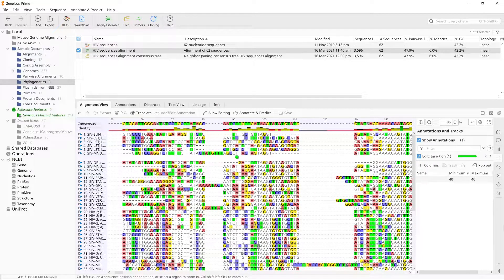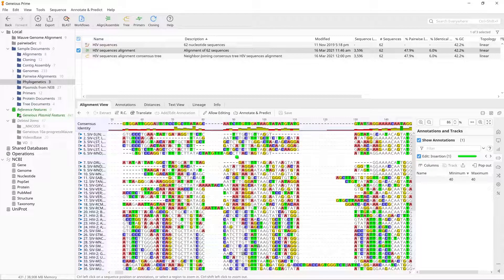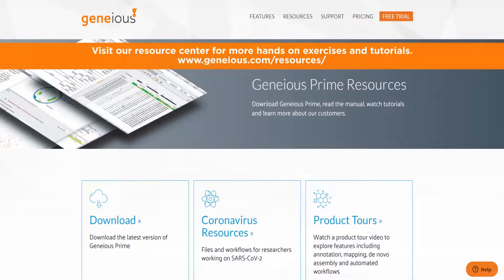Note that there are many large gaps, which is characteristic of an alignment of a rapidly evolving gene in divergent species. Visit our Resource Center for more hands-on exercises and tutorials.